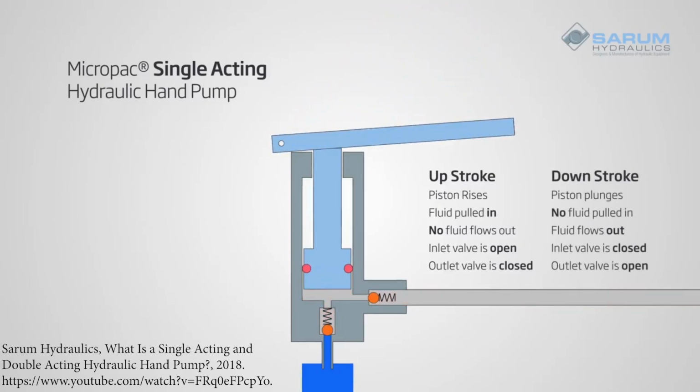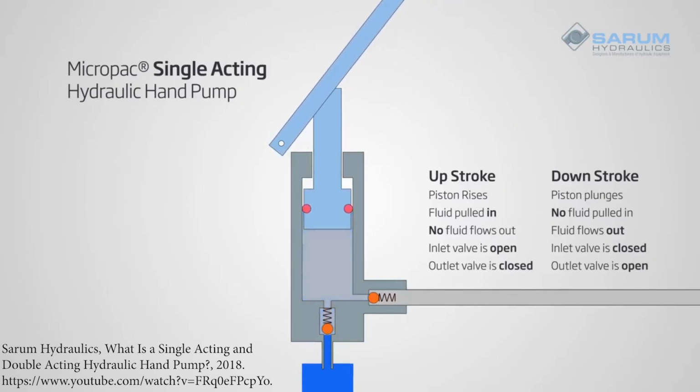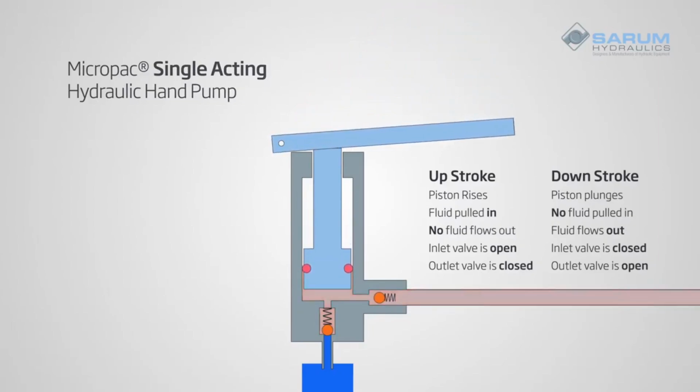So this is a hand pump. You sit here and you do this. Water goes in, water goes out. This is the same principle as those pistons you just saw. It's just we're using motors to do the pulling for us.